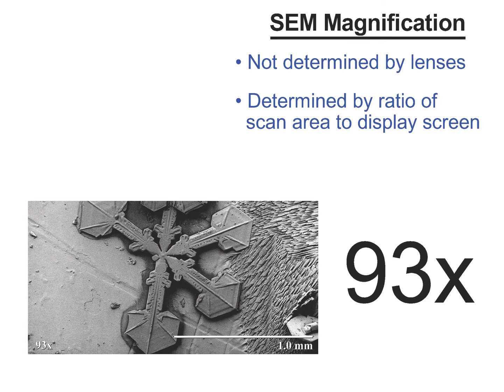This is an image of a snowflake in an SEM. And yes, there are some models of SEM that have cryogenic chambers for viewing frozen objects. The snowflake in this photo is magnified 93 times. Let's say I want to increase magnification of the area outlined in yellow.